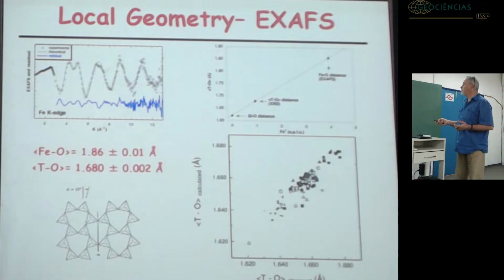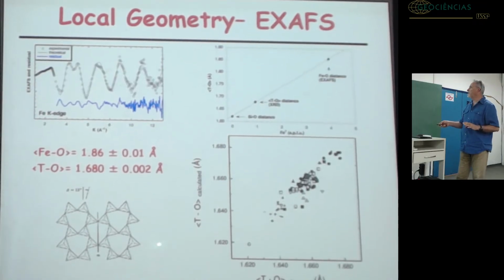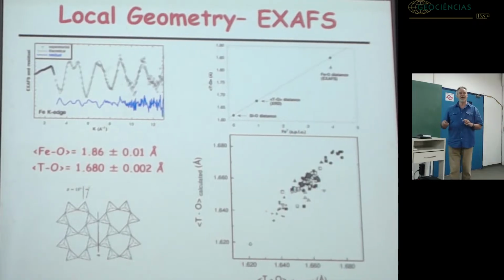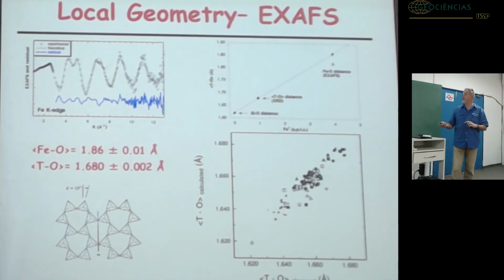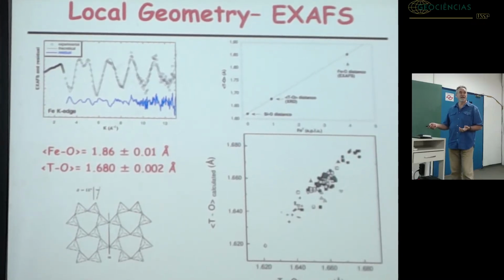In the case of phyllosilicates, it's easy. That's a tetrahedral layer seen from above, and actually you can adjust the tilting of the tetrahedra and the rotation. And so, if you rotate this tetrahedron, for example, in a way or in another, you can adjust a much larger tetrahedron within a set of smaller tetrahedra.